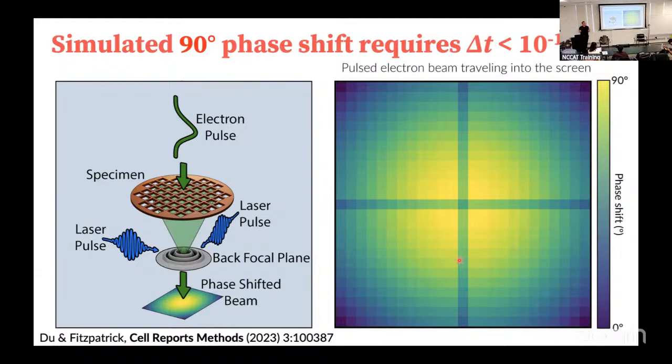I mean, it works really, really well. Why would you ever bother to do any of this? But in terms of getting the kind of phase shifts that you need here, and also that balance, as you pointed out, between elastic and inelastic scattering, you need a kind of scalpel, not a big lens to do it for you, yeah?